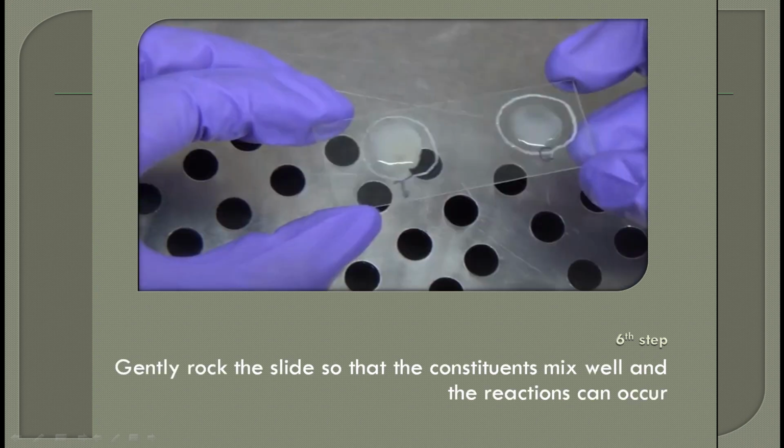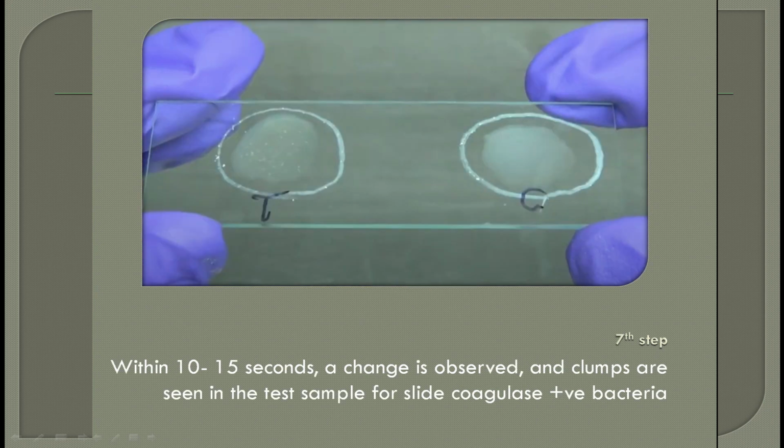Finally, all of this is done, and to mix the constituents gently, we will rock the slide on both sides and the constituents will mix well within each other and the reactions can occur. This reaction in slide coagulase test is very rapid, and within 10 to 15 seconds, we will be able to see a change, provided that the bacteria is slide coagulase positive.